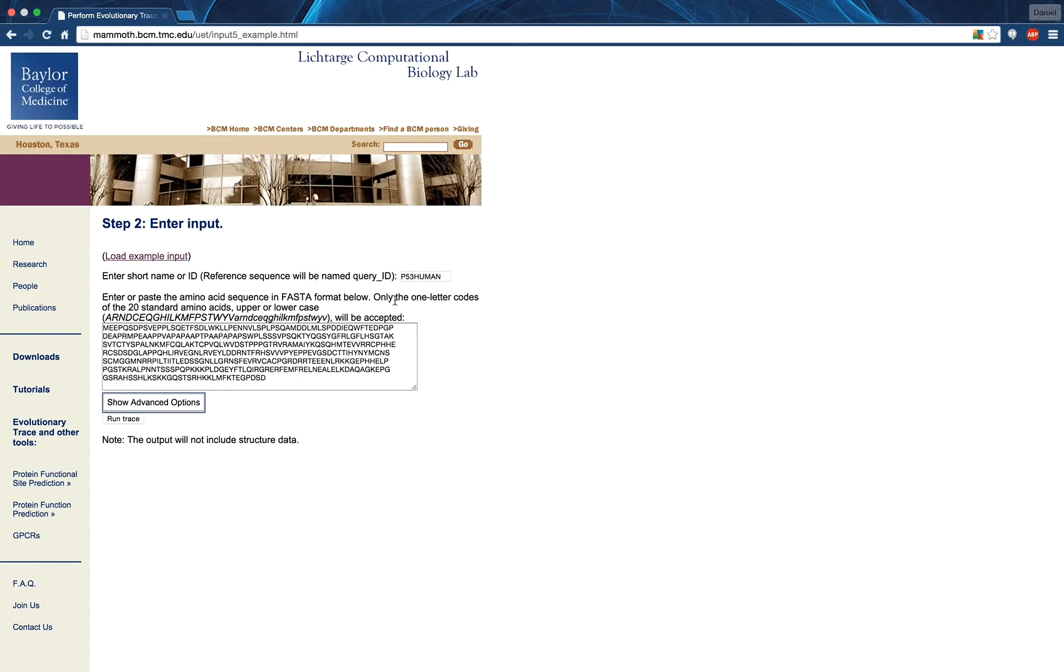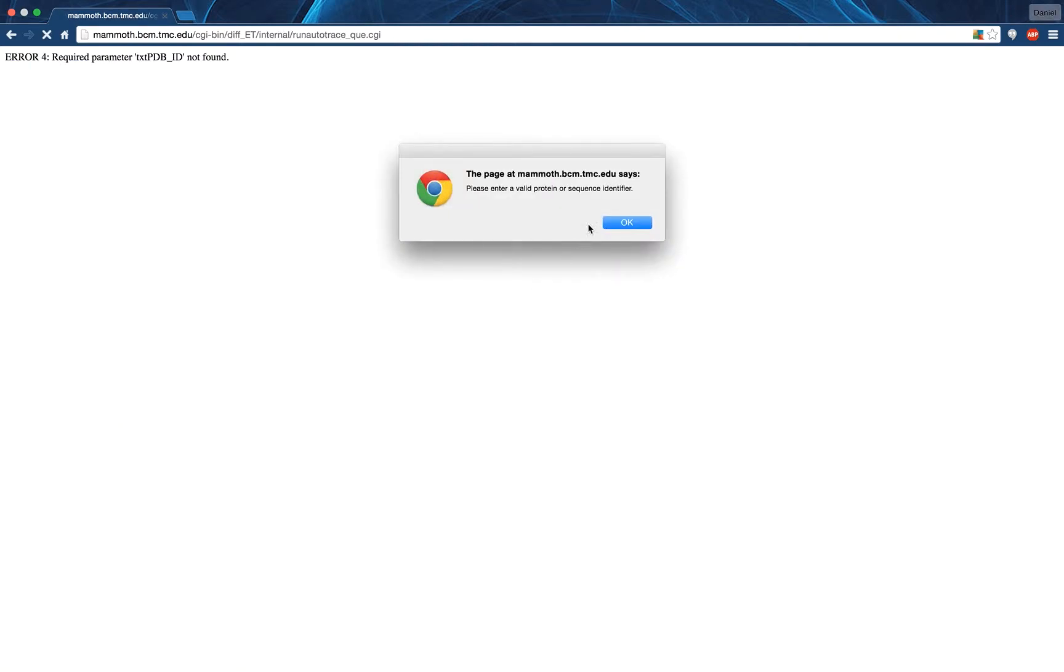It is also important to note that any FASTA sequence must be submitted with an identifier, or else an error will be thrown which returns you to the input screen.